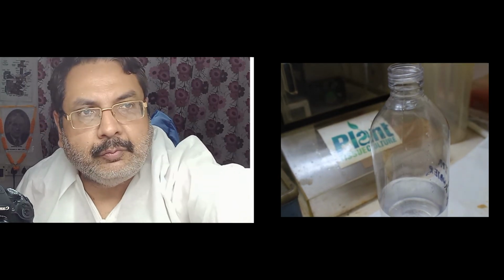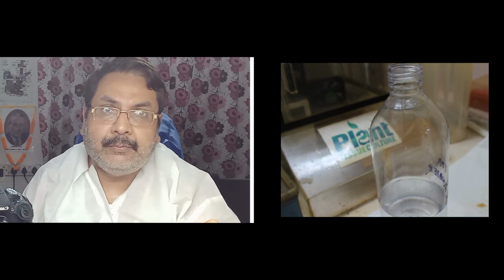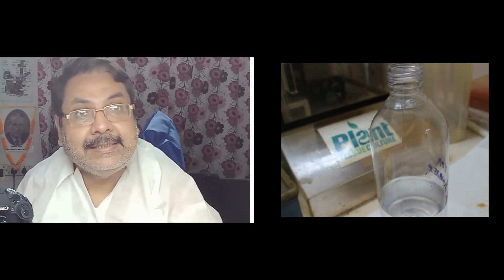One thing you should be careful about with auto pipettes: there are 3 things you have to remember. First, engaging the tips, then taking up the volume. First you have to release all the air from the pipette tip, then you dip it in the solution, and then slowly release the plunger. Don't put air bubbles in the media, because if you insert air bubbles in the fungal media, the fungal media will be damaged. The fungal cells will be ruptured. The bacterial cells can rupture because they will get an air embolism. So never ever release the air inside the media.